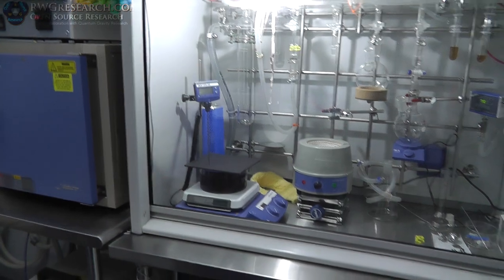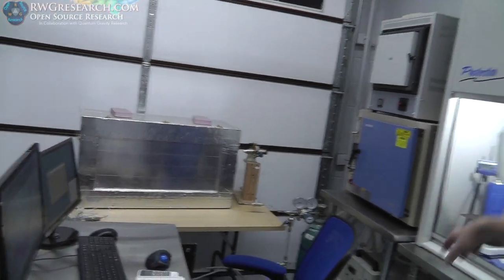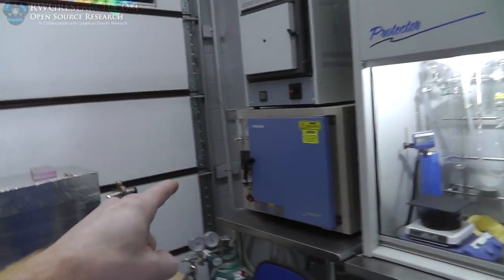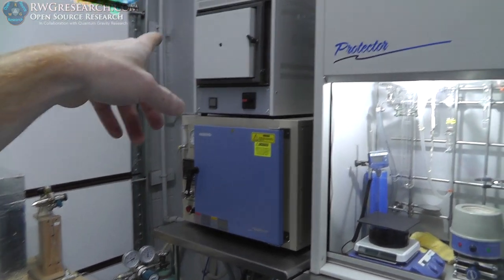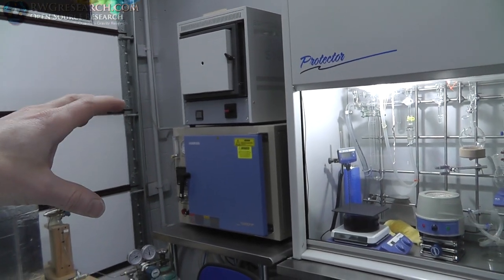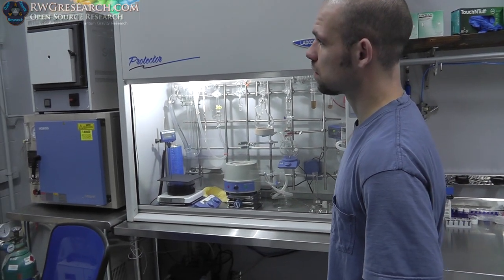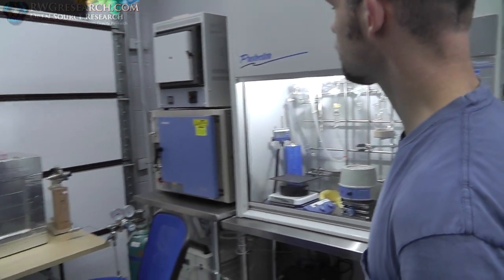That's awesome. There's the kind of furnace. That's actually a vacuum oven, a 500 degrees Celsius vacuum oven. So it's a really high temperature vacuum oven. And then this one is 1,300 degrees Celsius, but it'll do argon flow. You can kind of control the atmosphere, but it's not sealed. So you're just flowing, but that's acceptable for most applications.